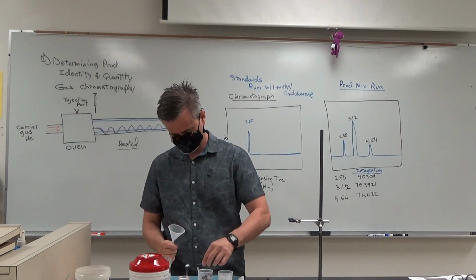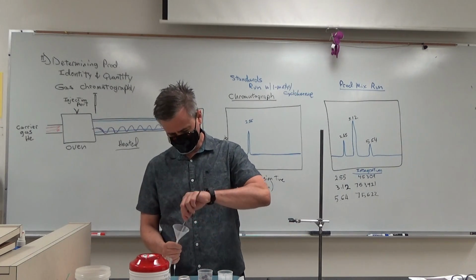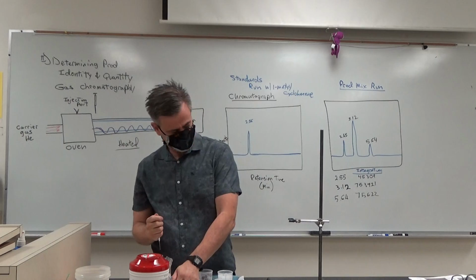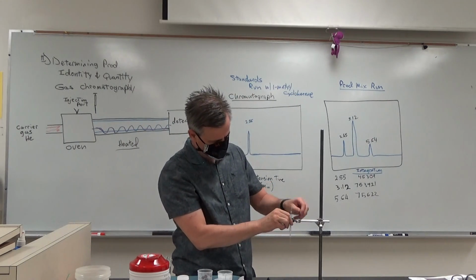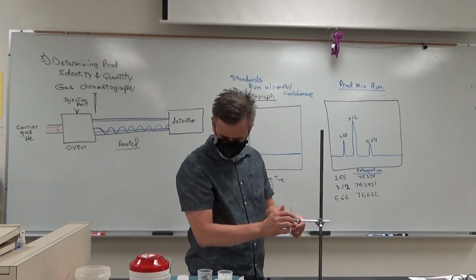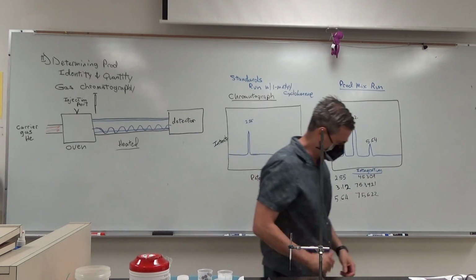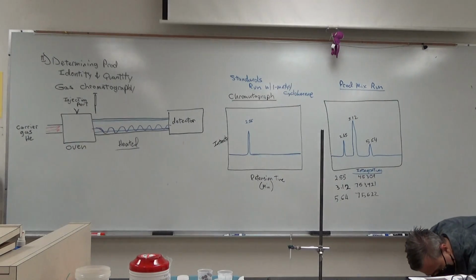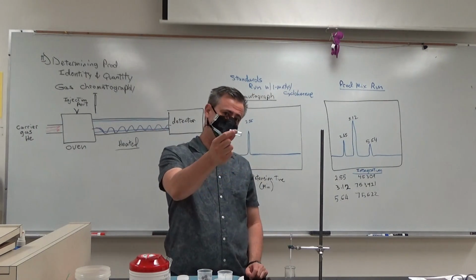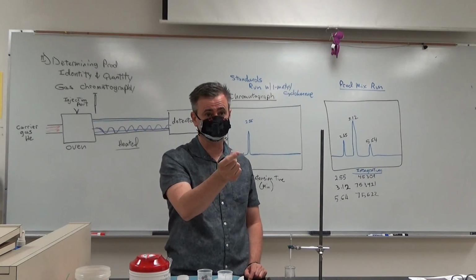Fashion funnel here. All right, good enough. More than enough. All right. Okay. All right. Now I've got my mixture. I've got my mixture of my 90 of acetone, 10 microliters of my stuff, and then 1.5 mils of chloroform. Okay?